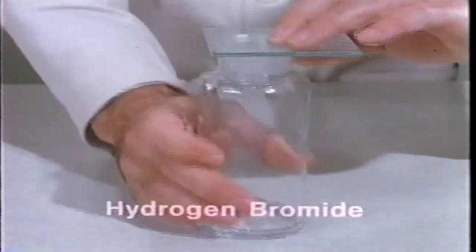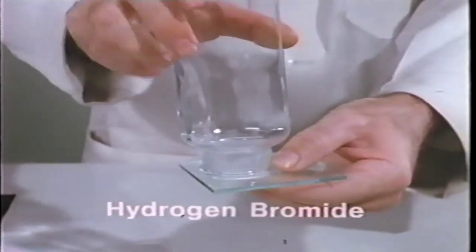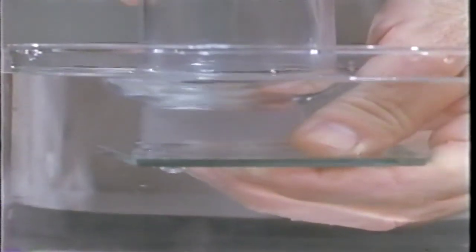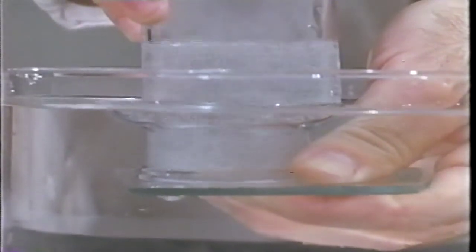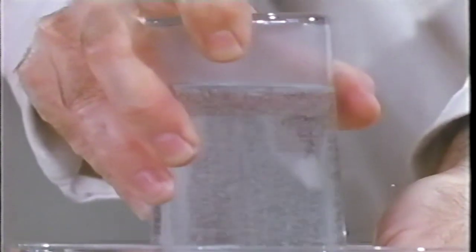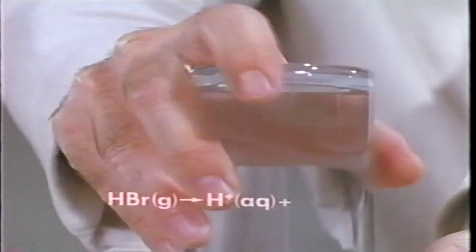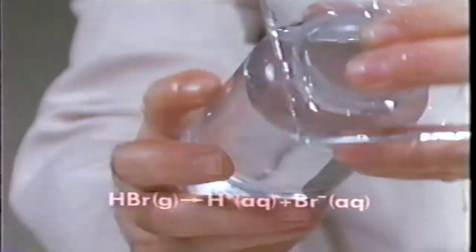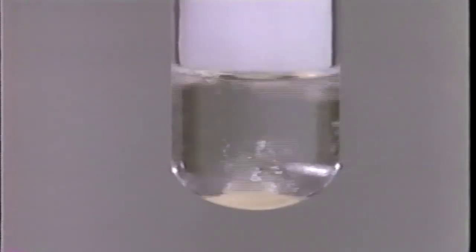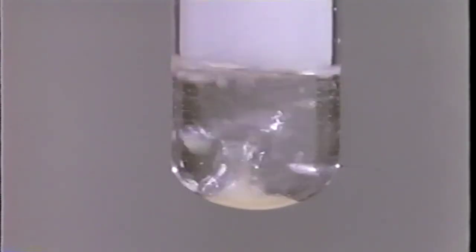This bottle contains pure hydrogen bromide, the product of the earlier reaction between hydrogen and bromine. When we let hydrogen bromide come in contact with water, the water level rises rapidly, indicating hydrogen bromide is very soluble in water. The net reaction is HBr gas gives hydrogen ions and again bromide ions. Because most inorganic bromine compounds are soluble in water, virtually all of the world's bromine is dissolved in the oceans or trapped in underground brine deposits as bromide ions.